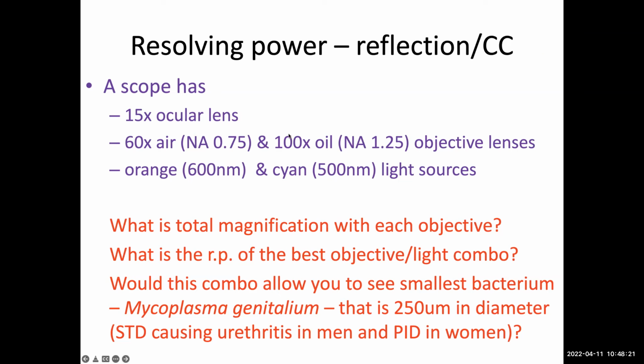I'd say, actually, I'm not sure. Absolutely fine. Thank you for answering though. And if you're ever unsure, guys, just saying you're unsure is a fabulous contribution and I really appreciate it. Okay, Stephanie, you also raised your hand. Can you tell me what you think? The NA with 1.25, because it's bigger. Yeah, bigger NA. Yeah, good.